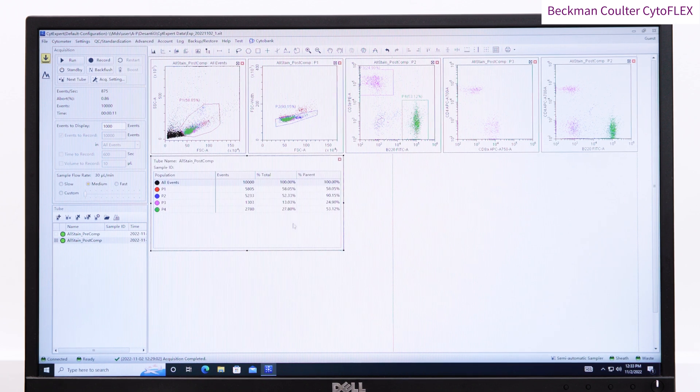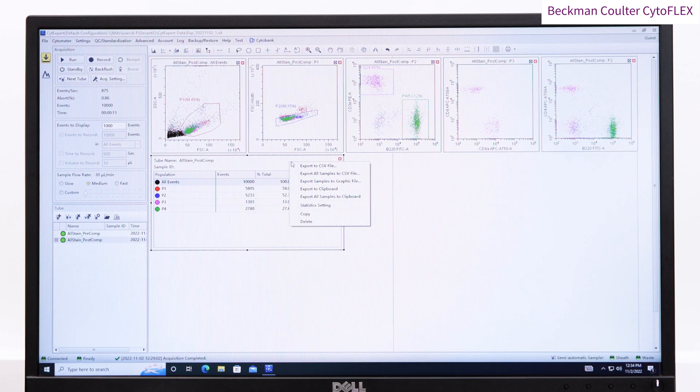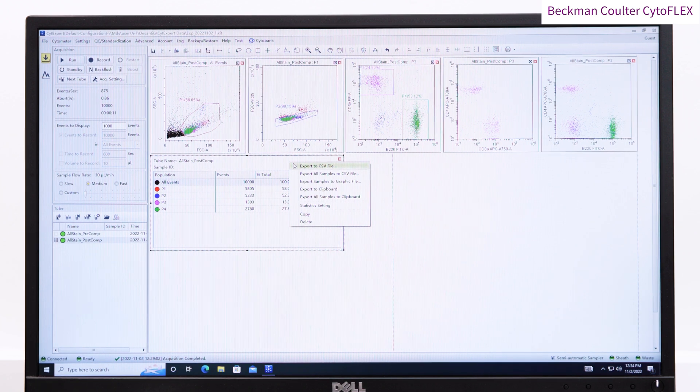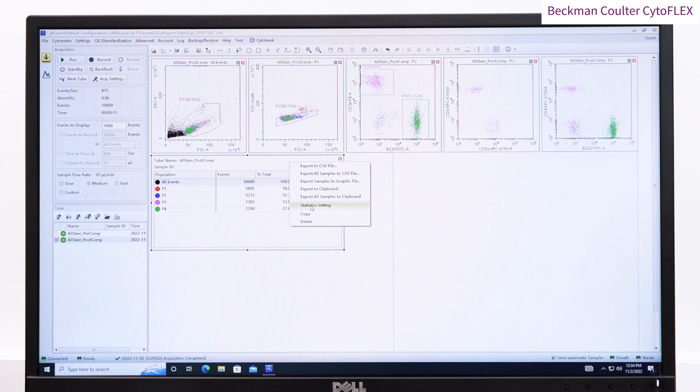Right click, choose statistics settings to determine which values are displayed. You often want volume, median of your fluorescent channels, and the percentage parent.